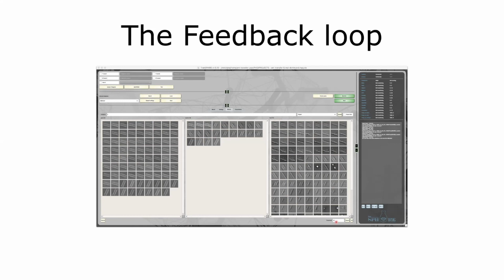Afterwards, it will repick with the threshold provided in the lower right corner and present you the results in a new window, and you can check: do I like this result or do I need to fine tune again? This is an iterative approach.